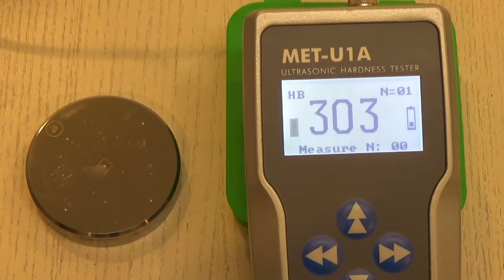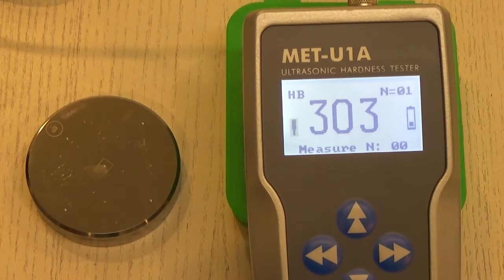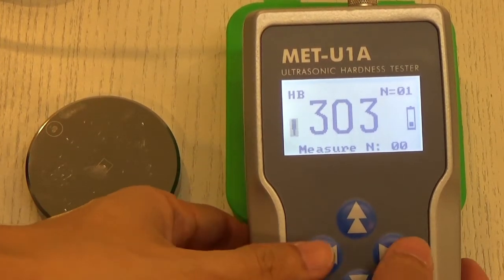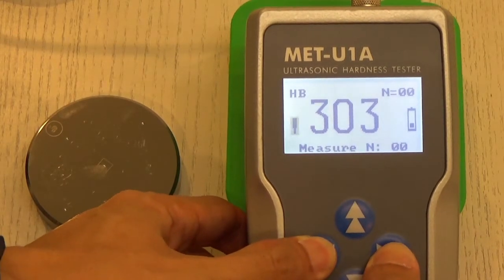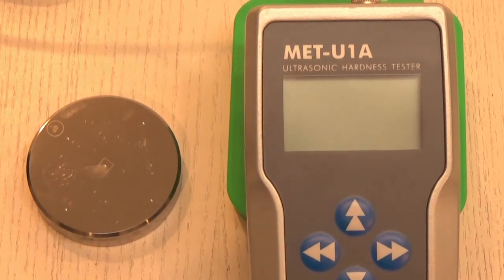After the beep sound, the reading is immediately shown on the screen — in this case, a Brinell reading of 303. That's how you use the METU1A ultrasonic hardness tester from InnovaTest. To switch off the equipment, press both the left and right buttons at the same time and the machine turns off. Thank you.